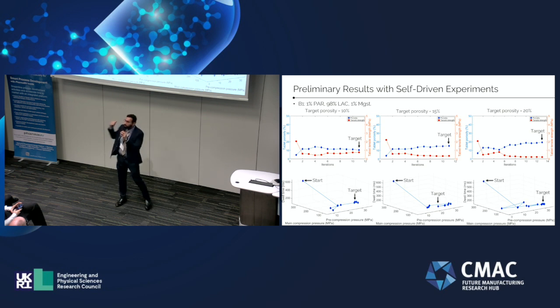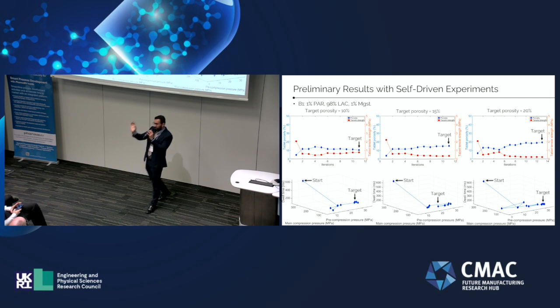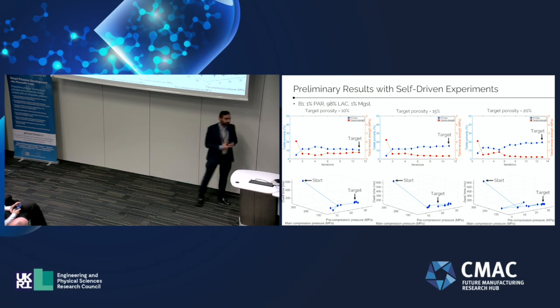So with the help of robotics, that's not too much work for us. We have permanently attached that 99% reflectance disk on the robot. So before producing every tablet, before scanning any sample, we do the reference and the dark scan to make sure it is consistent over the range of different experiments. Okay, I think so.